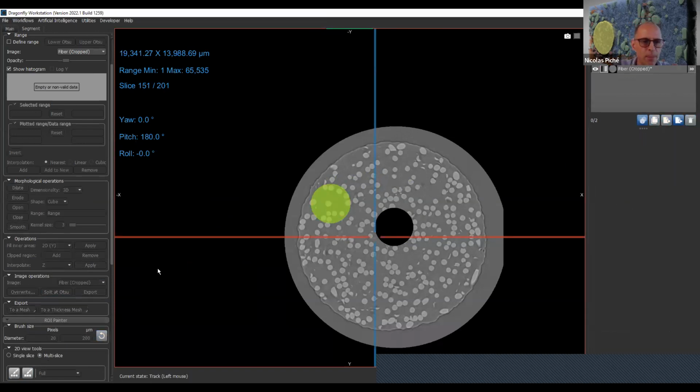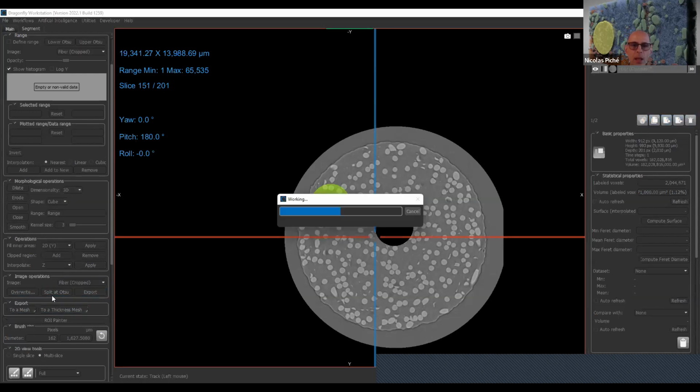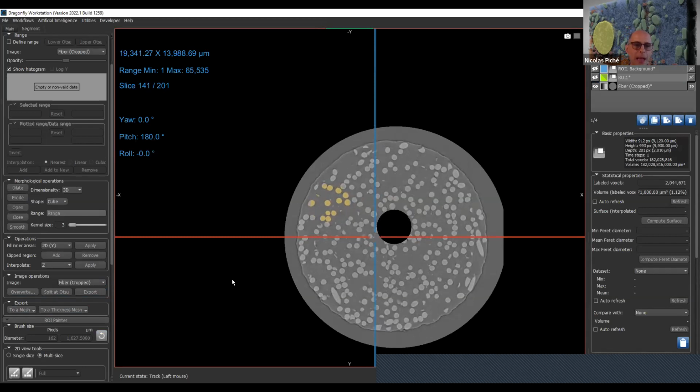Sorry. Okay, and of course with the region of interest, you can split, you can export, you can crop, you can override, and you can generate meshes. And this is important. Let's say that I go back and I segment one of the fibers. Okay, I do a split Otsu again, and I take only the fiber stuff. So I have a couple of fibers. I can export the fiber itself. I select it, and can export this fiber as two different types of mesh.